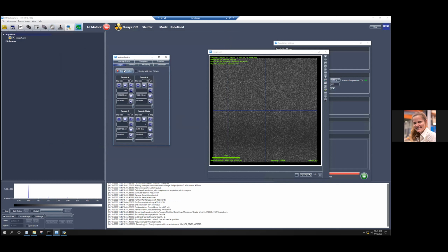There's another stop all motors button here. There's lots of them. Other motors that you may move, the pinhole. Sometimes when you have a bright spot somewhere, just a single bright spot in your field of view, it might be the pinhole that you maybe bumped a little bit. You can move 2 microns in X or Y, plus or minus. I would just put continuous imaging on and do that, and see if the bright spot gets worse or goes away. Try to go in the direction that it goes away. I wouldn't move more than like 2 microns in any direction for X and Y.